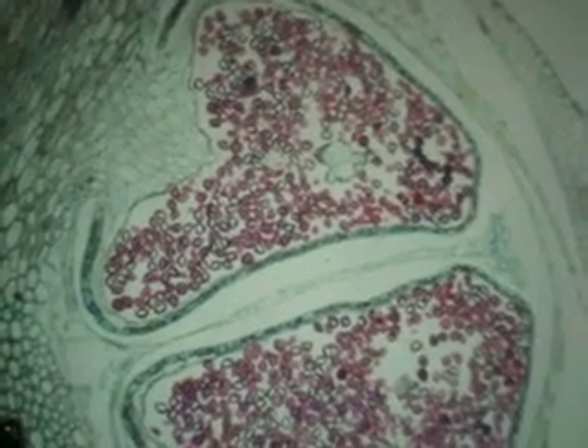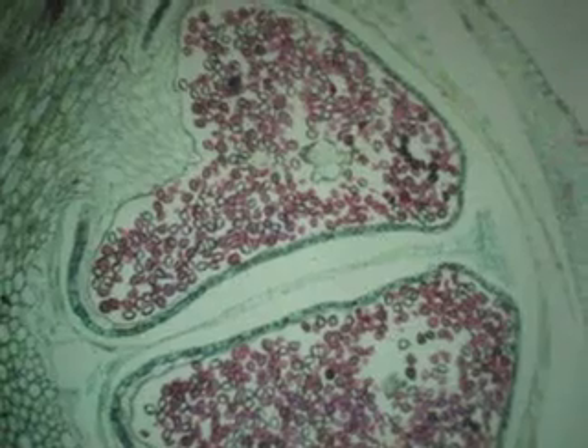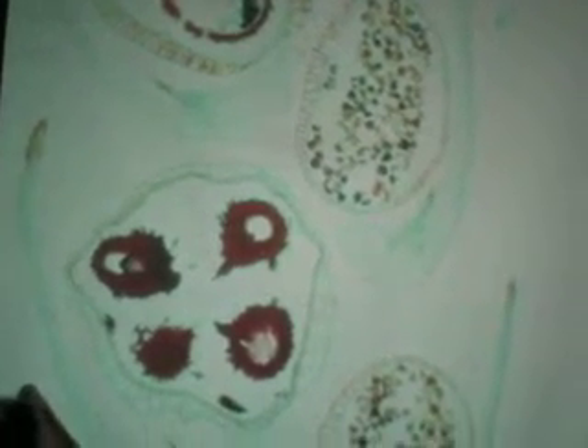I don't see spores — I see clumpy chromosomes — so you might see some sporocytes undergoing meiosis, or maybe not. See the clumps? That's at 40x power, that's why it's so dark. Cross-section is number four. Here are the sporangia, and these are the spores inside the sporangia. It's homosporous, so they're just plain spores. There's a sporophyll — a leaf — in cross-section, here's a sporangium, there's the spores.